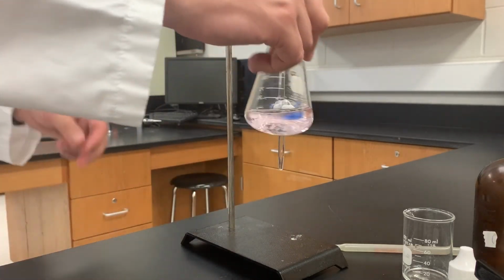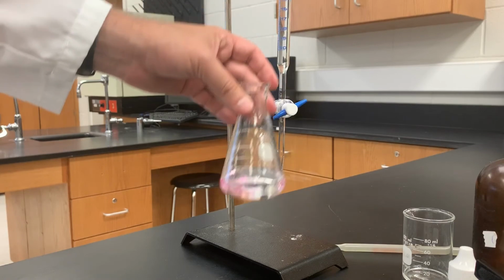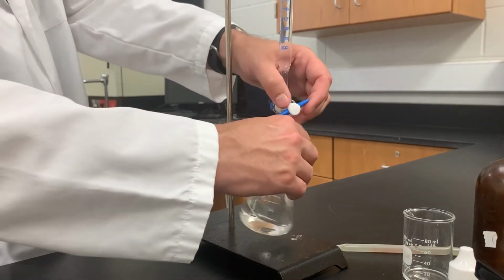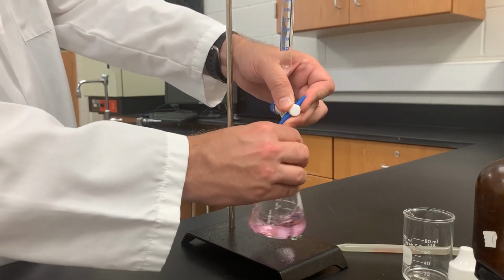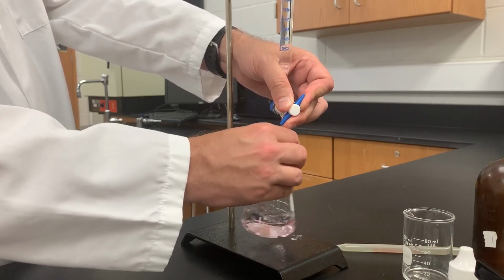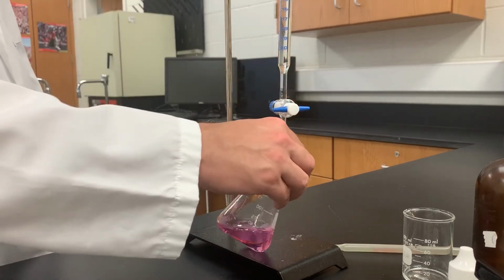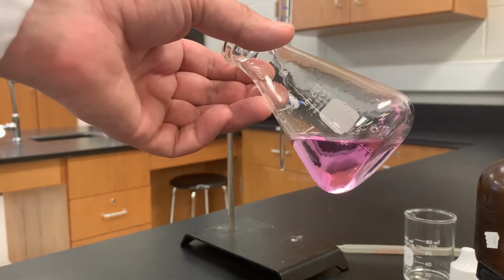And there we have a very faint pink color that we're looking for. Maybe a little difficult to see. But the faint pink, well, it's actually faded. Let me add another drop. See if we can get it to stay. It needs to stay pink for at least 10 seconds. Not quite there. There we go. That is the faint pink color that we're looking for.